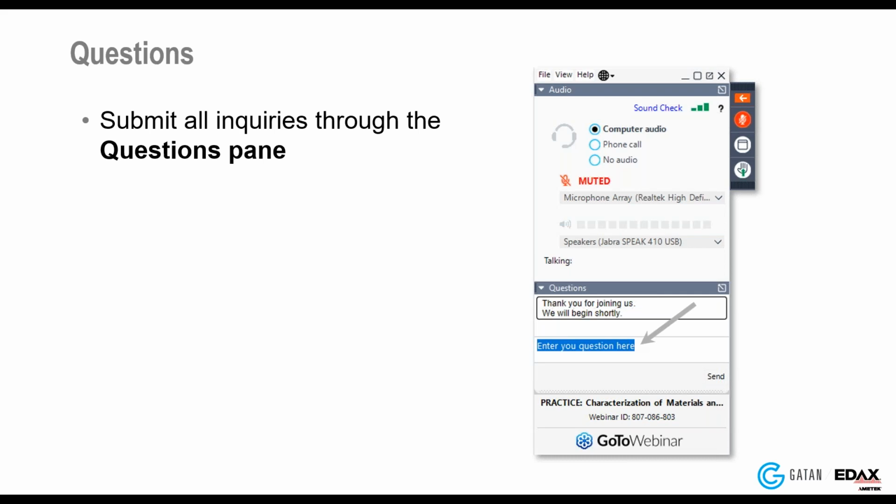All right, first question we have, David, is: what is the minimum detection limit? Honestly, we're still really discovering what that is. We've tried this on a number of different material systems, with pretty good success in most cases. Within the talk, I mentioned that we've analyzed materials with a few weight percent lithium, and I think it's reasonable to expect that we could go below that and push down towards 1 weight percent. Ultimately, it's going to vary from material to material, and maybe even depend on whether there is a lithium-free analog available to act as a standard. But I think somewhere approaching 1 weight percent is a realistic expectation at this point.